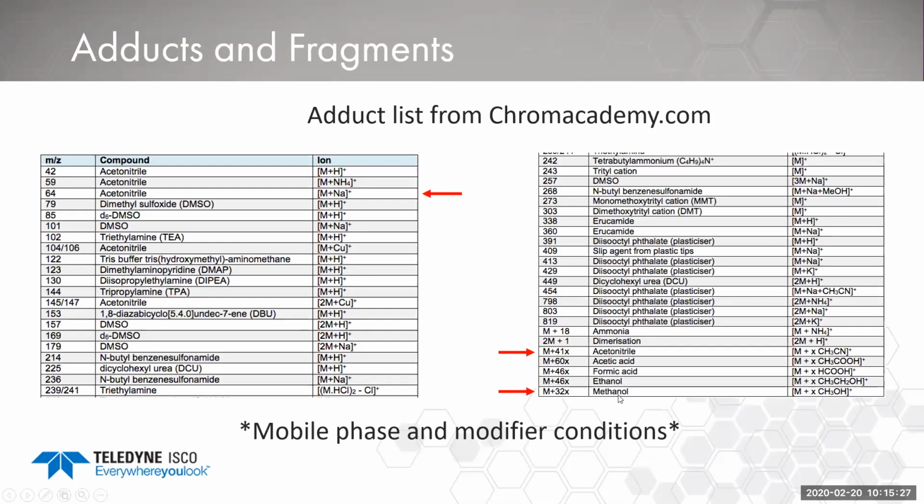The reason we're seeing this is we have a mobile phase that we're using to incorporate our sample into the mass spec after it's been diverted from your flow stream. That's going to be your methanol adduct because we're using methanol with a little bit of a modifier in there. Now, why did I also see acetonitrile? Well, I was running the chromatography with acetonitrile. So we could potentially have 2 different adducts because we're using 2 different solvents in the process of getting our compound from the injector over to the mass spec.